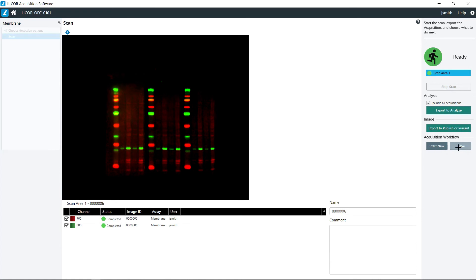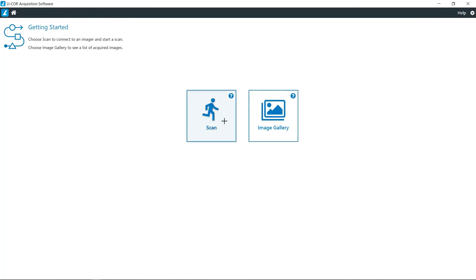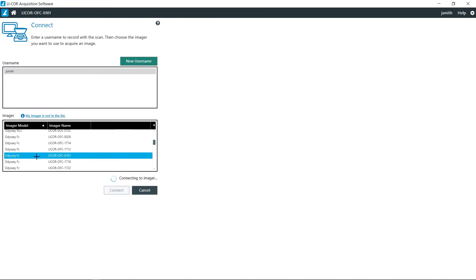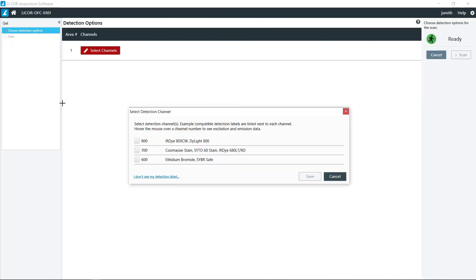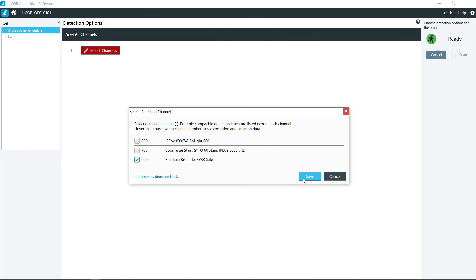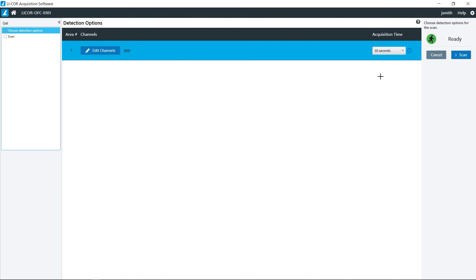For gels, we go back out, we do the same process of connecting to the imager, click on gel, and then if you have an ethidium bromide gel or one of the SYBR Safe type of stains, you would then choose that. You also have the same choices of acquisition times, generally for the stain gels, 30 seconds to one minute is perfectly acceptable.